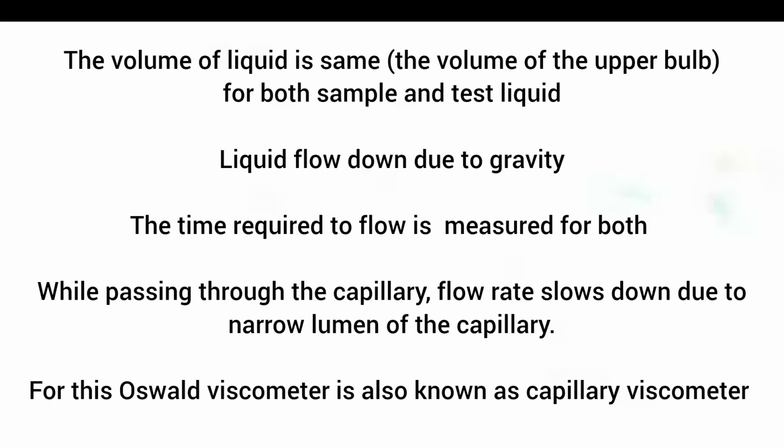The volume of the bulbs is constant. The upper bulb will have the same volume of water and the sample, but the weight may be different. If the density is higher, the driving force will be higher. Hence, it's important to measure the density of the test liquid and water.